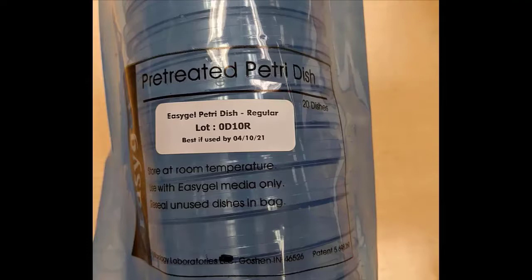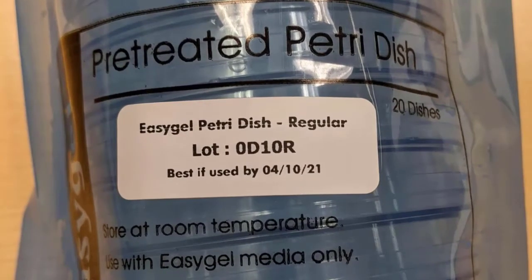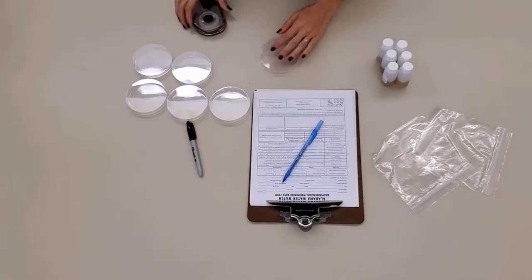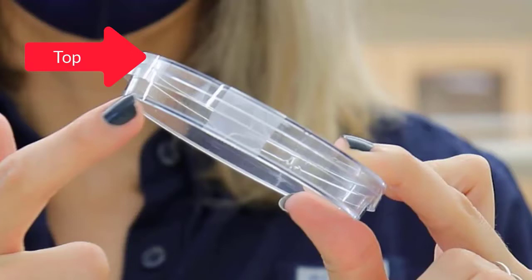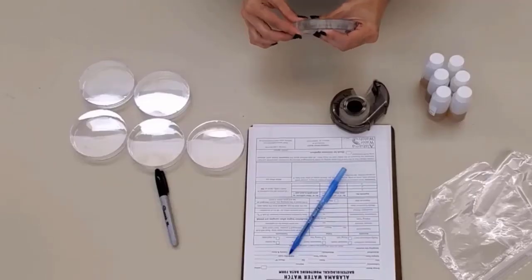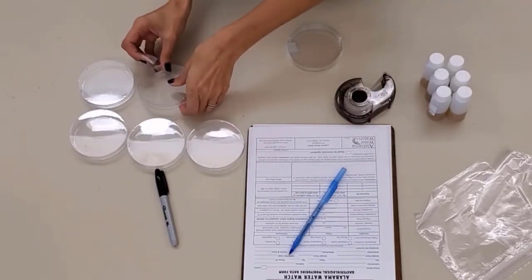If you find that you have received defective plates, note the lot number and expiration date and put them aside. Report the issue to the Alabama Waterwatch Program Office so that we can advise you on how to proceed. Prepare your Petri dishes by taping the top, which is the larger piece, to the bottom on one side of the dish. Keep the Petri dish closed as much as possible to avoid contamination.